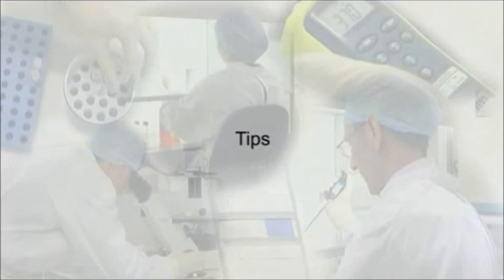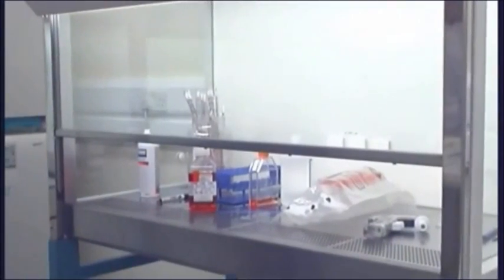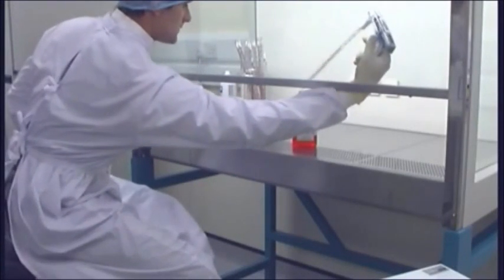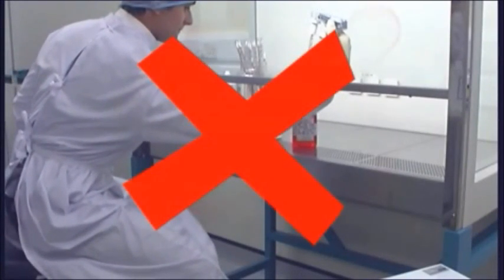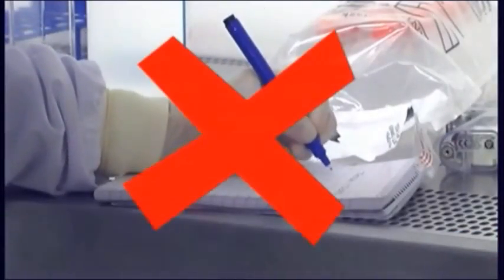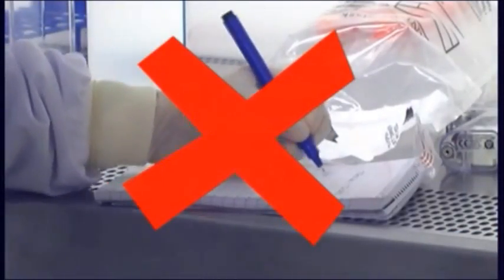Observe these tips to work effectively with the safety cabinet. Keep the cabinet clear of unwanted items. Work as near to the center of the cabinet as possible and at least 15 centimeters from the front. Do not obstruct the air inlet grills.